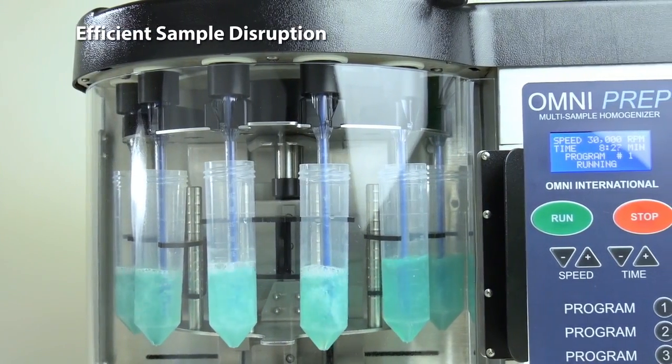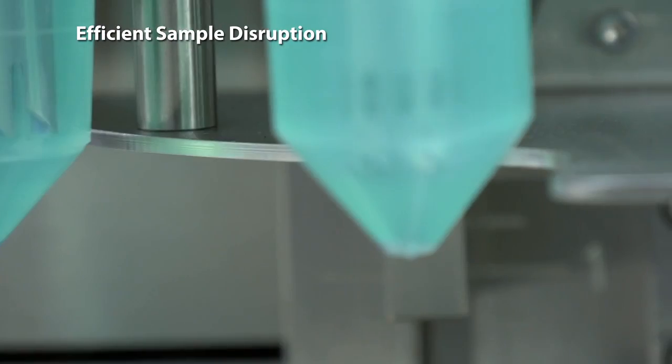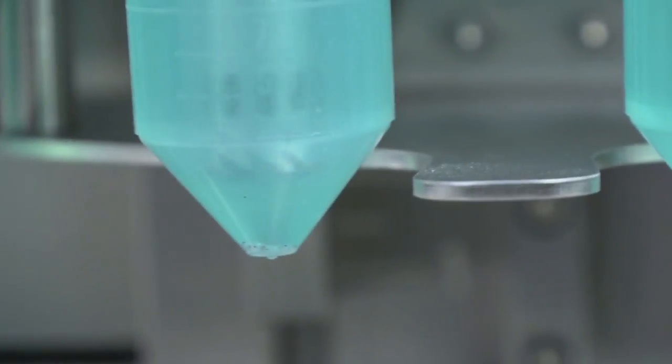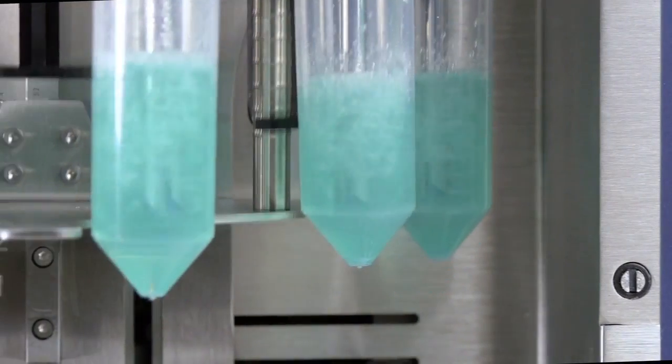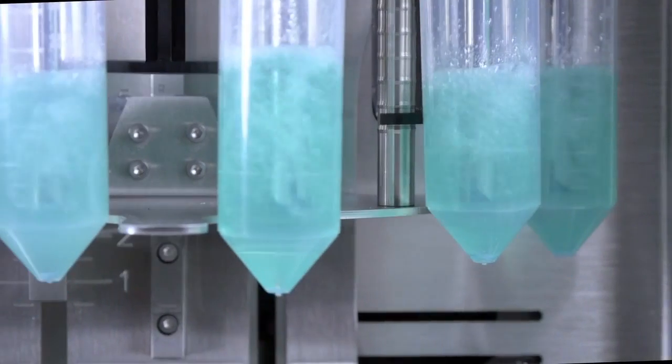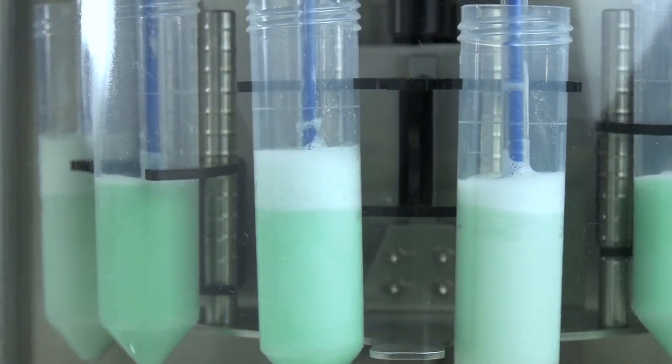Efficient sample disruption is achieved by unique generator probe oscillation, including up and down motion to replicate human-like movement of generator probes and ensure contact between generator probe and sample.